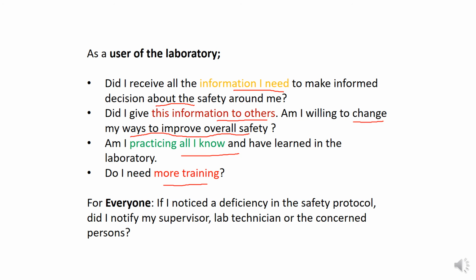Okay, so the basic trainings. For example, whenever there are research projects in our department, plant sciences, the undergrad students have a special problem or research project in their final semester. Once they come to us and select us as a supervisor, we give them training: how to use this equipment, how to use this chemical, and why you want to use this chemical, in detail. Although they took this course, they need to refresh it practically in the first week. Okay, so this is really important. Being a user of the lab, you should get the basic training, and then you can work.